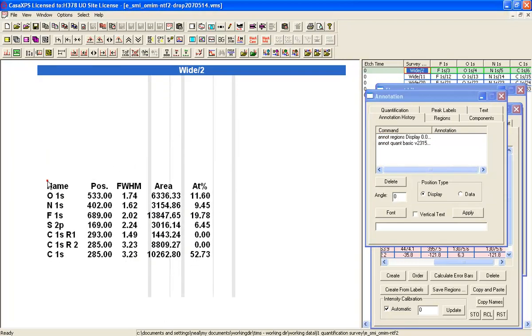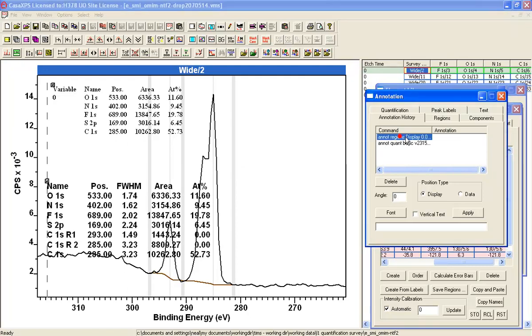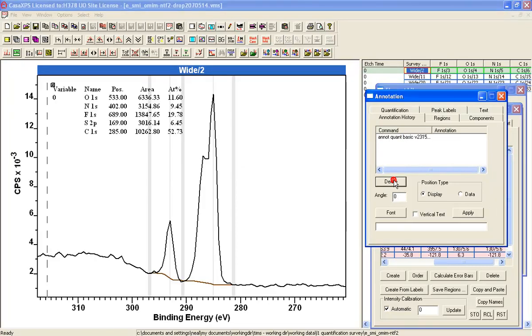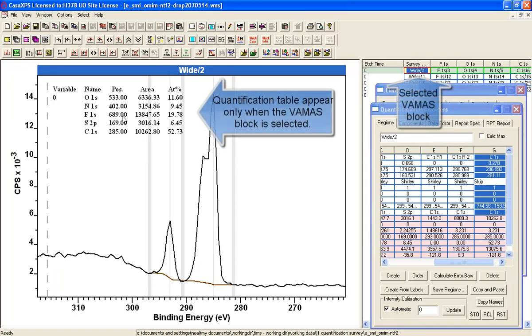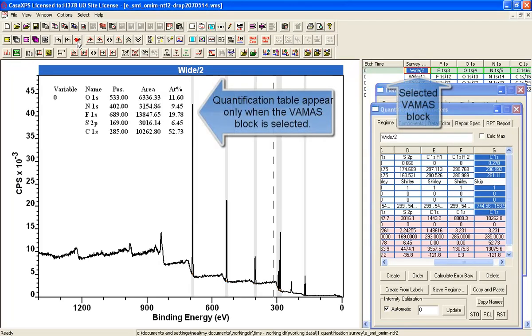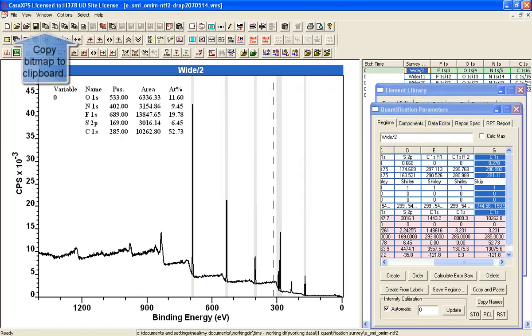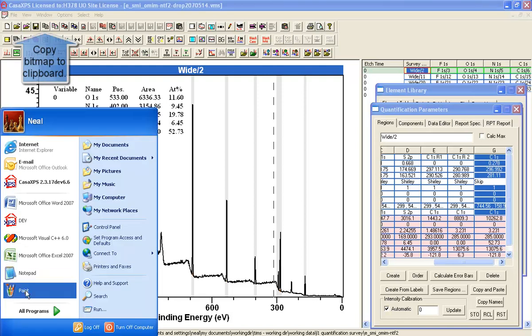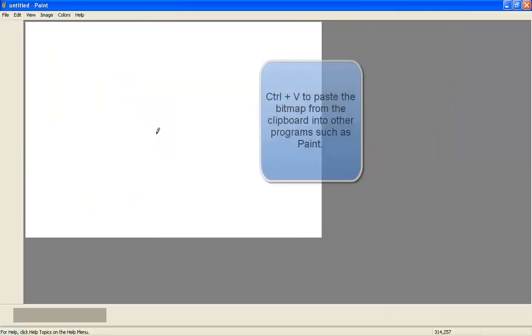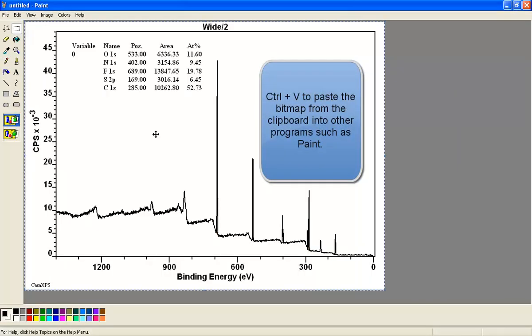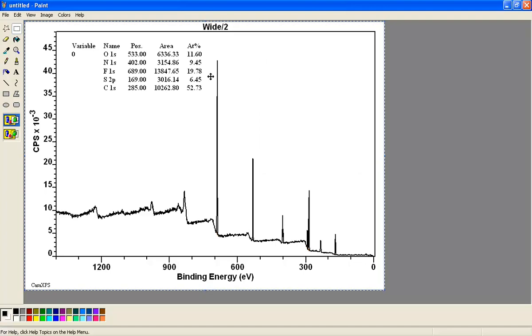So what I'll do now is just delete this table here. And we now have a quantification report that I can then copy and I can put that into some other program. So there's a report coming from the survey spectrum based on these regions.